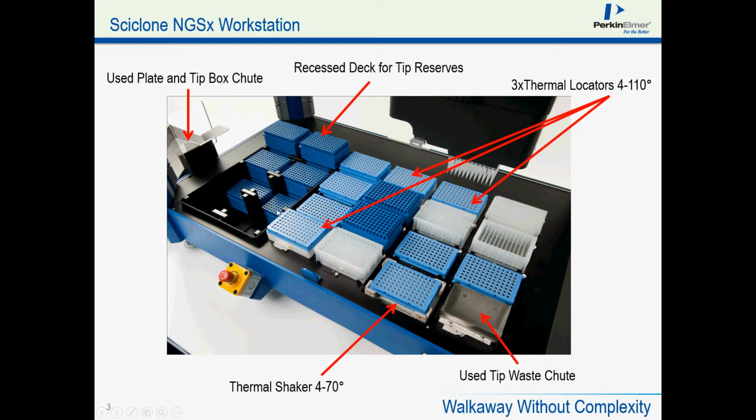design, just for images, showing that you can put 3 stacked tip boxes. On the bottom where my mouse is, it's empty right now, and then this one shows a single box, a double stacked, and a triple stacked box. In this section, we can hold 24 tip boxes in reserve.